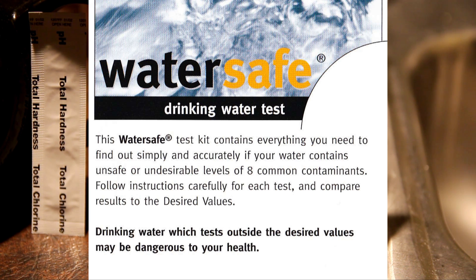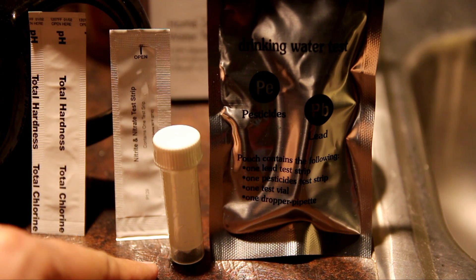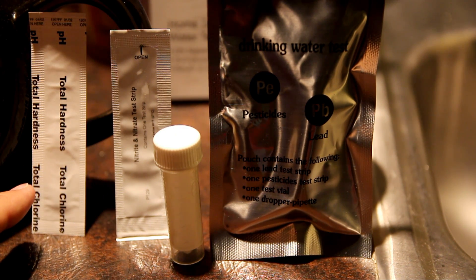Today I'm going to test my water with a kit I bought. It's a WaterSafe city water test that tests for lead, chlorine, nitrate, bacteria, pesticides, hardness, and pH level. I'm going to compare my reverse osmosis filtered water against my regular city water. This valve is for the bacteria test, this strip is for pesticide and lead, this strip is for nitrate, and this test is for pH and total hardness.